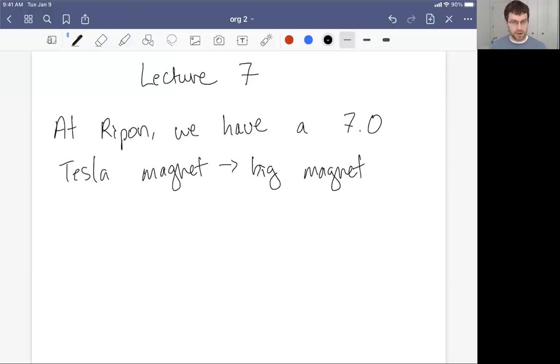And really, the superconducting magnet isn't the biggest part of the instrument. The majority of the instrument is just something to hold a bunch of cryogens to maintain a superconducting magnet. It can be as strong as 7 Tesla. So anyway, it's just a big magnet.